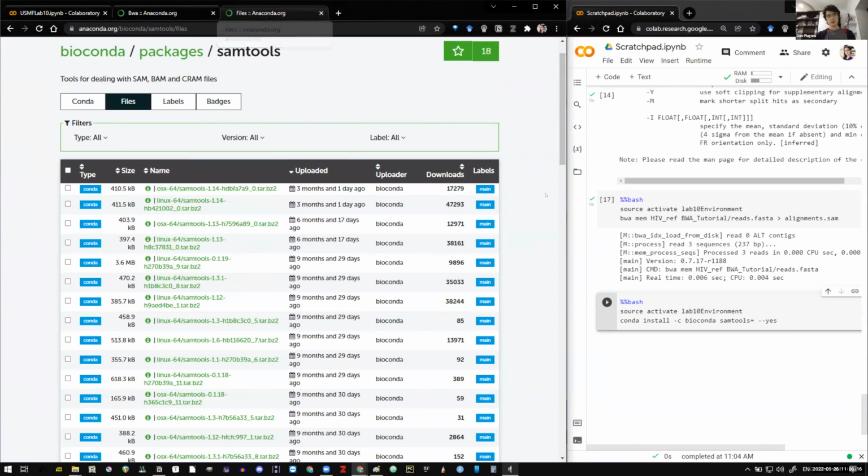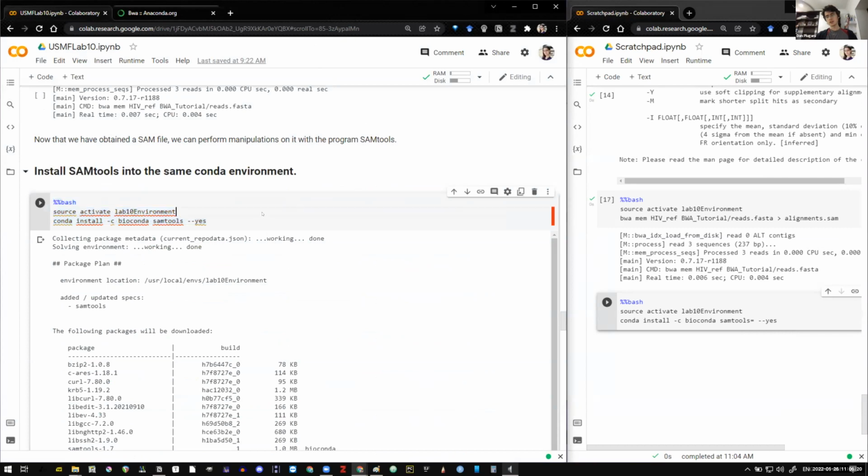So about bwa, this is the function that transforms that special file into a SAM file. It does the alignment. Okay. And you mentioned that we do bwa mem and then the prefix. What does that prefix do? hiv_ref.